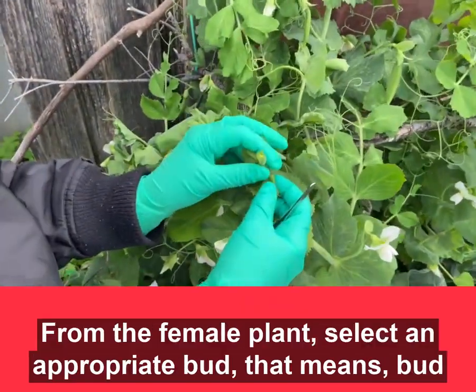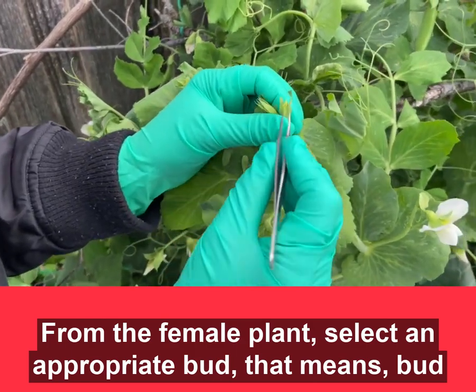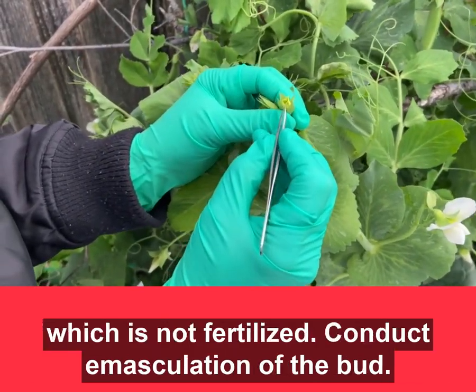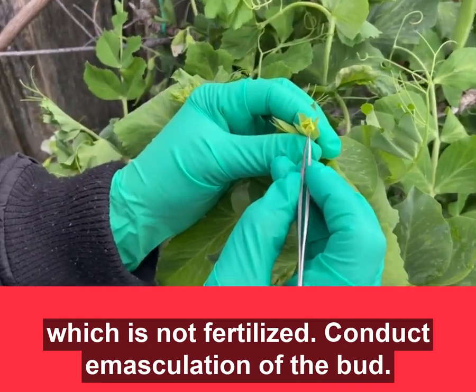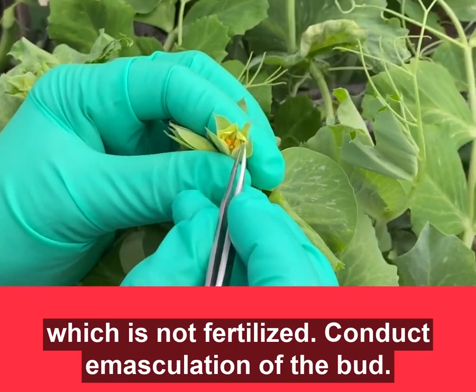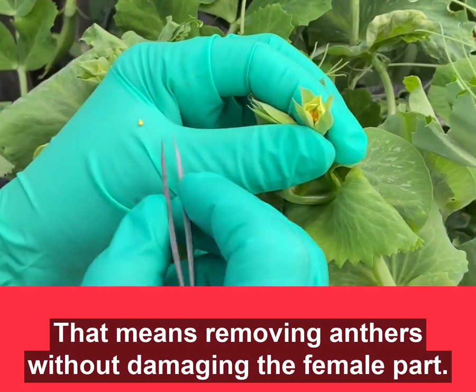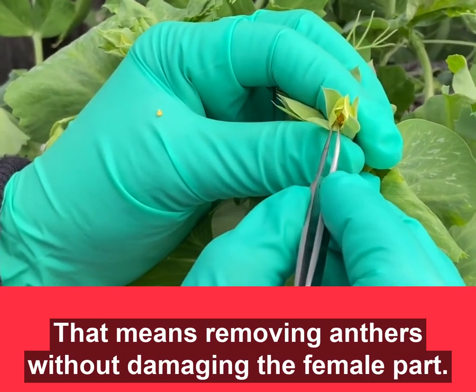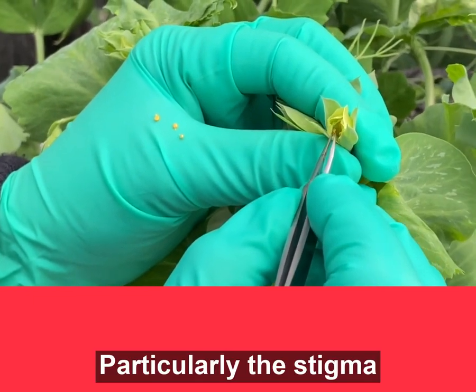From the female plant, select an appropriate bud — that means buds where the pollen is not yet fertilized. Then we conduct emasculation of that bud, which means removing all the anthers from that bud without damaging the female part, particularly the stigma.